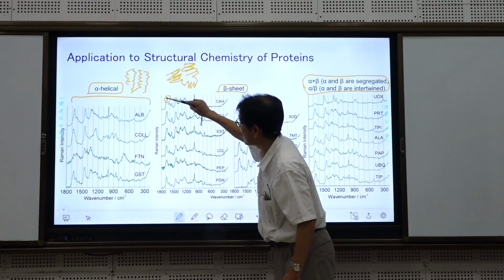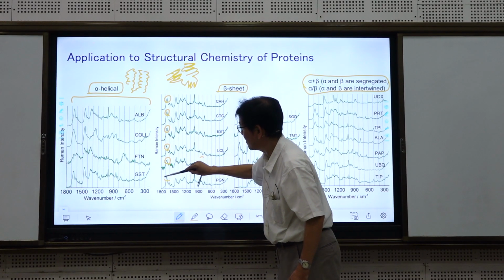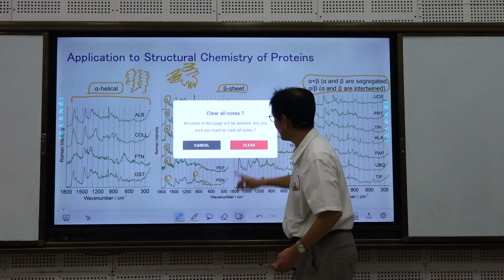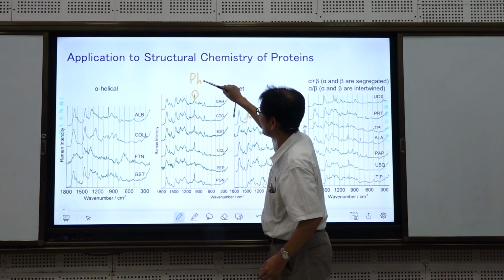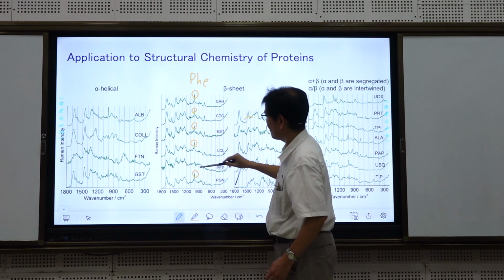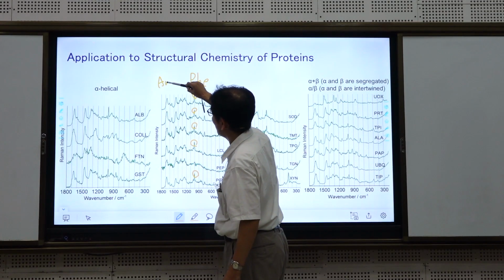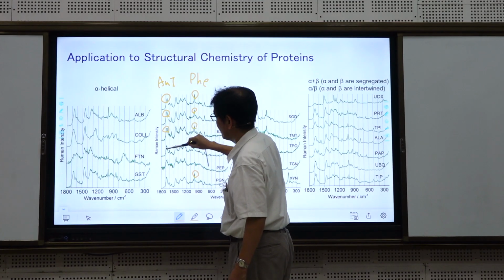Okay? Here is amide 1. Here is phenylalanine. I will explain what amide 1 is later.